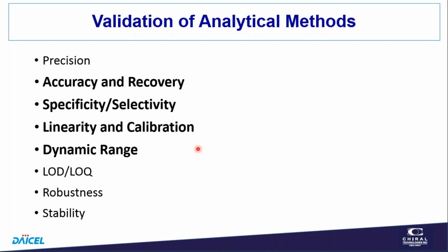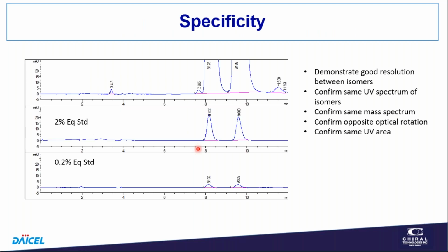And so there may be a few issues just because we're really dealing with a low-level component, but it's no different than we would treat impurities in achiral chromatography. So we want to demonstrate good resolution between the isomers. And as I talked about before, for two major components, that's probably pretty good. It's probably pretty good if we have two low-level components. We might have a problem if we have one high and one low.